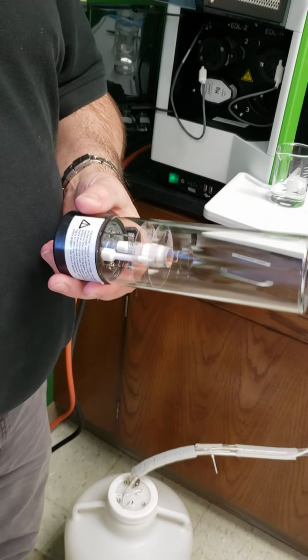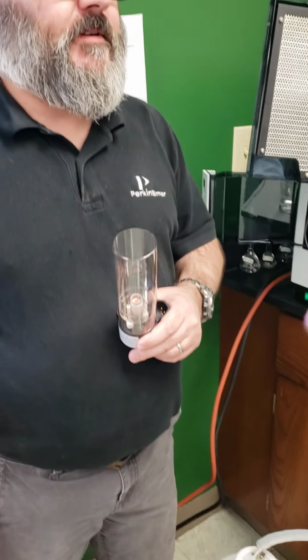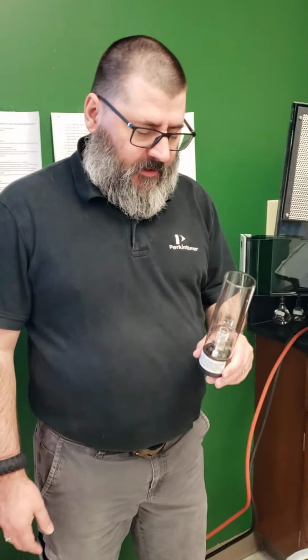These guys want to put their hands on it. Okay, I'm going to demonstrate first, and then let him run the samples and process the results, printing everything. Is it okay for me to do a video, by the way? Sure. Yeah. Okay, thank you.